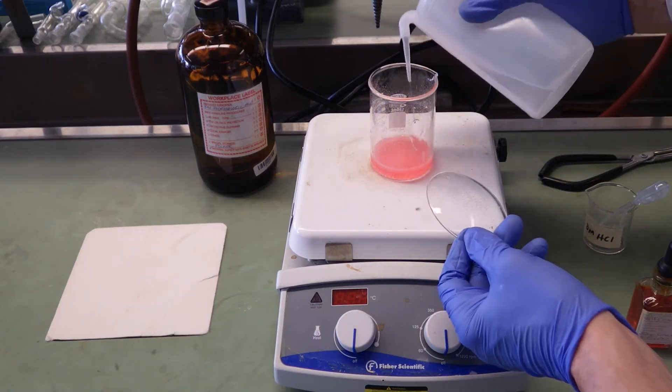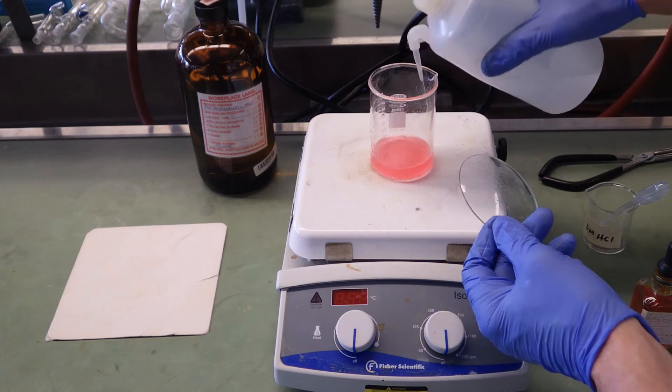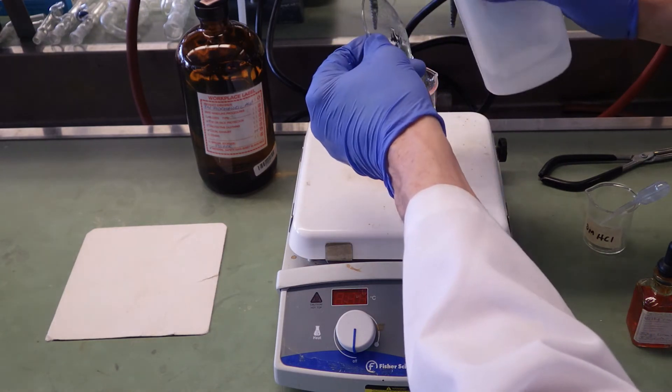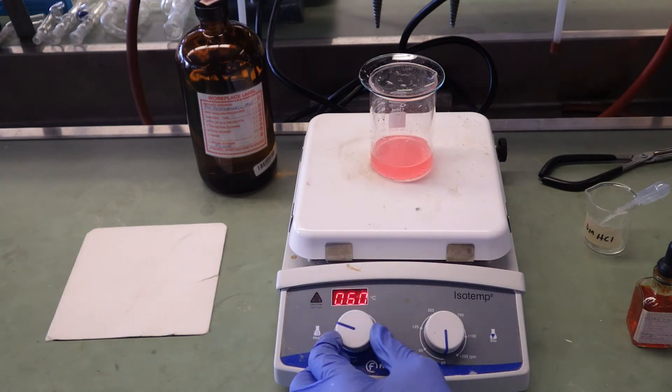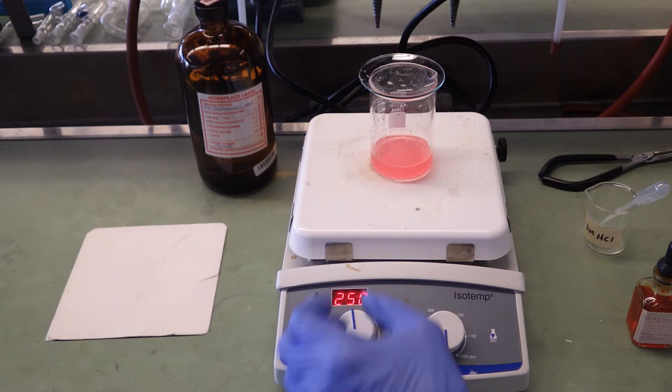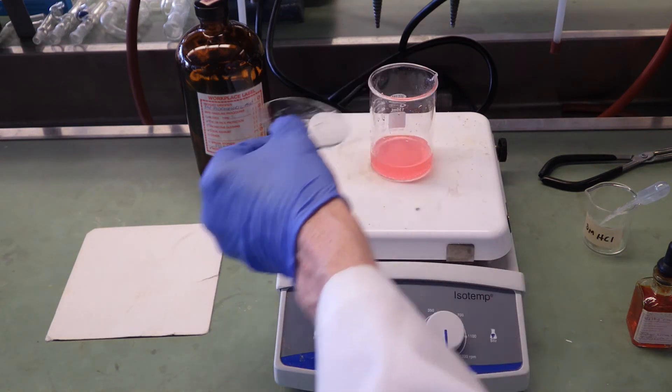I'll rinse down the sides of the beaker and the bottom of the watch glass to make sure everything gets into the beaker. I'm going to heat this at a fairly high temperature to boil down the water. And I'll have to remove that watch glass to make sure that the water can, in fact, boil out.